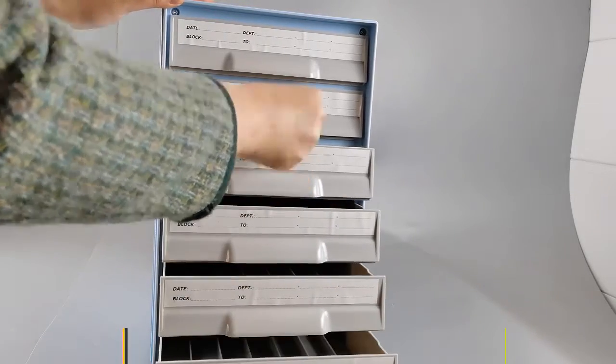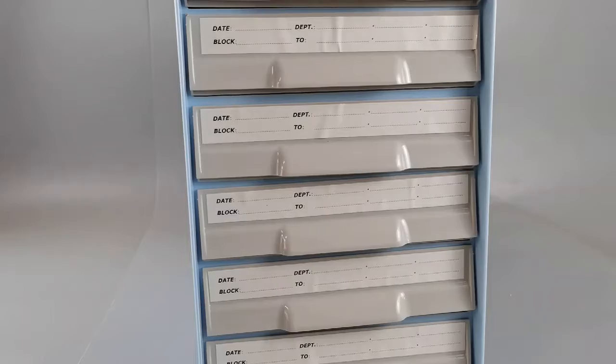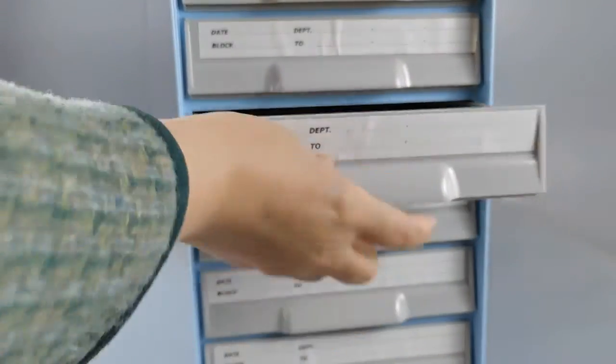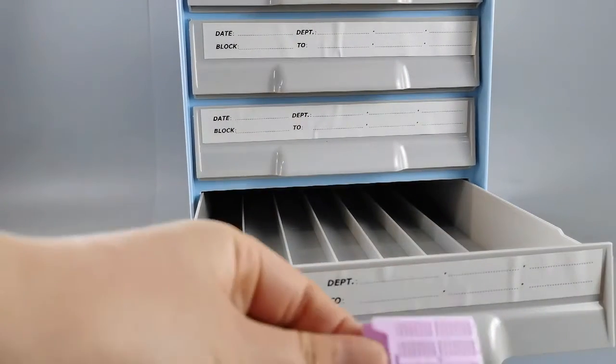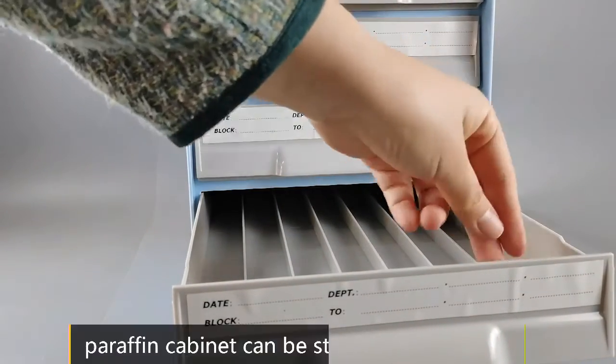Enclosed hand-tailored handle with polished finishing for safe as well as convenient cabinet sliding. Each cabinet unit contains 6 drawers for up to 2100 blocks, and marked with a plastic-covered label for identification.